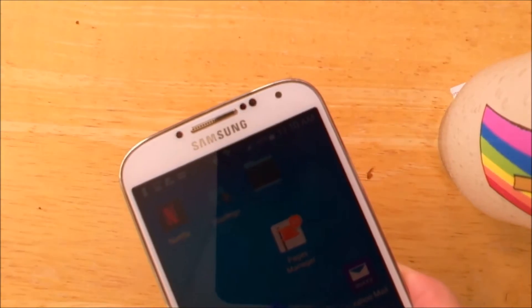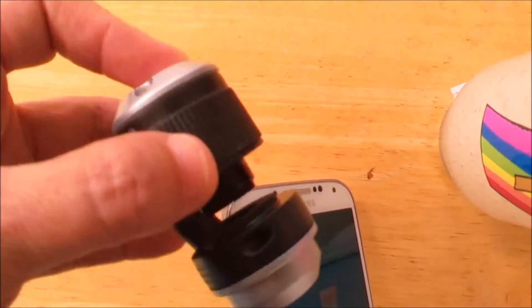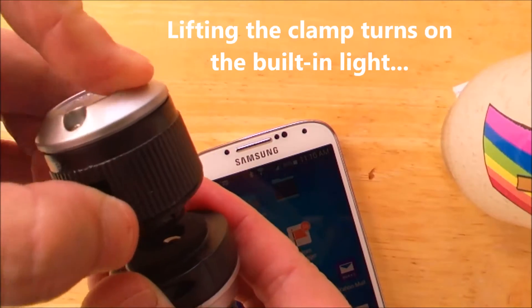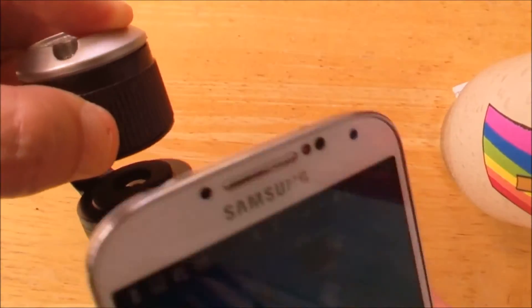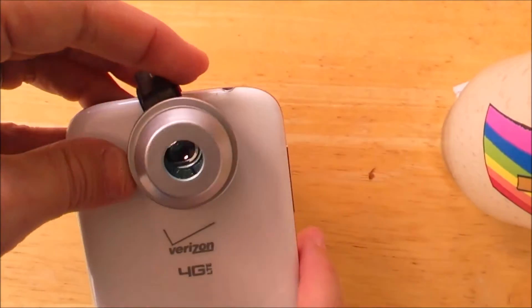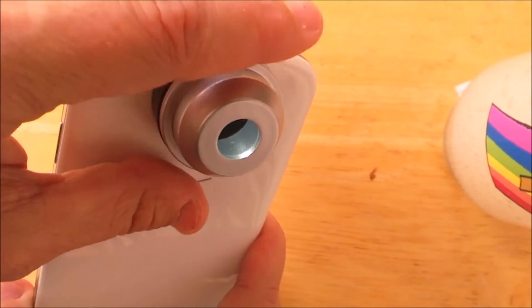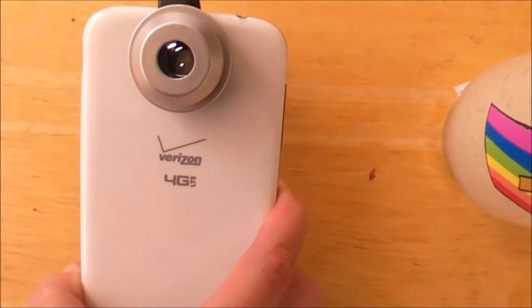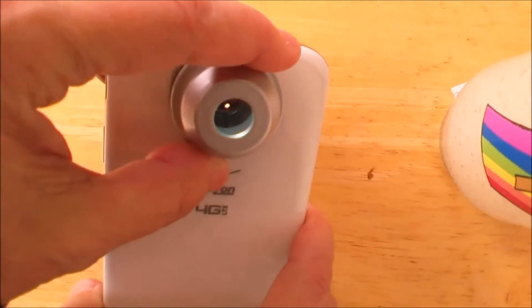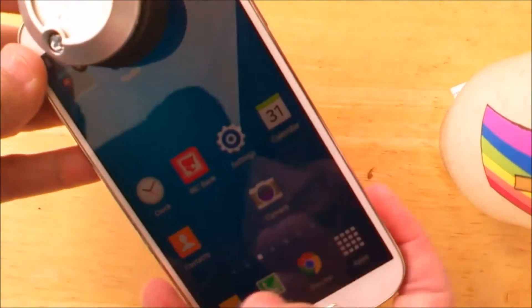I have my Samsung phone here. I did have to remove the otter case, so I lift both little nubs on the side and I stick my phone in. Now you want to turn it around and make sure — see how there's a light in there? You want to make sure your own camera lens is in the center. I lined up my own camera right in the center of the hole. And now you turn on your camera app.